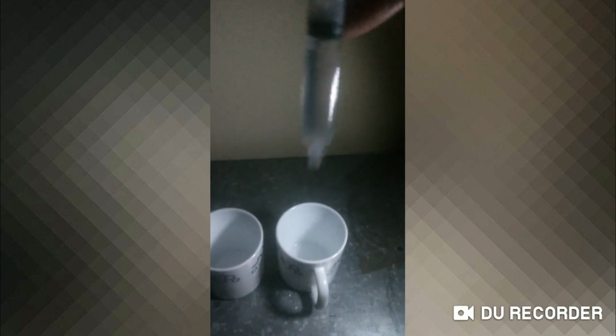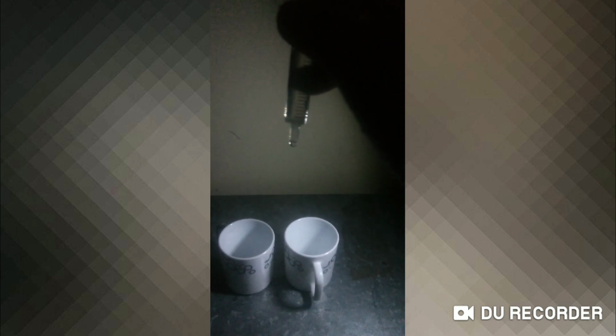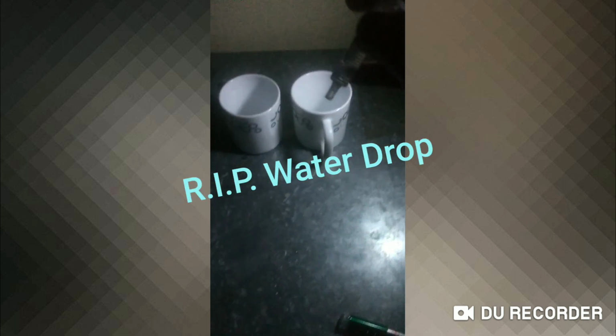I've taken this syringe which has a drop of water suspended. I think I messed it up. We will first fill the syringe with a lot of water, and then suspend a little drop of water like this. I think I let it fall. This is the amount of water that we will be keeping. I think I messed it up. Very sorry for the inconvenience.